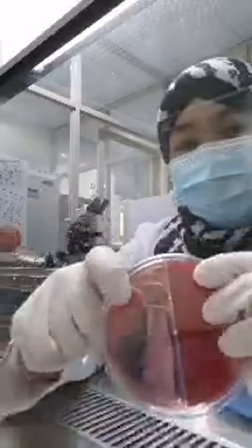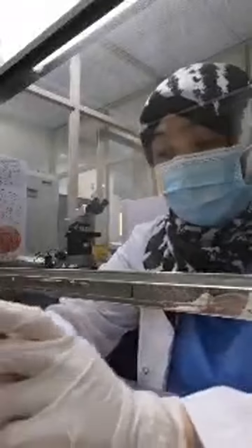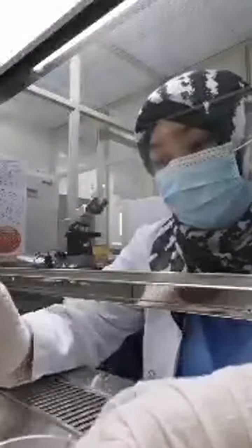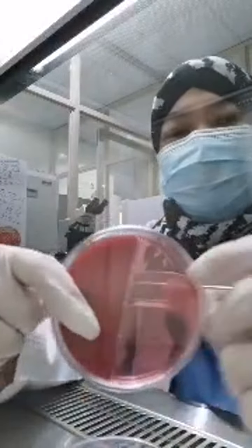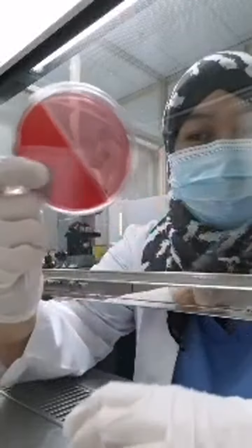Then this is MacConkey agar. For the MacConkey agar, the only thing that will grow here is the gram-negative bacteria. For this one, anything will grow.